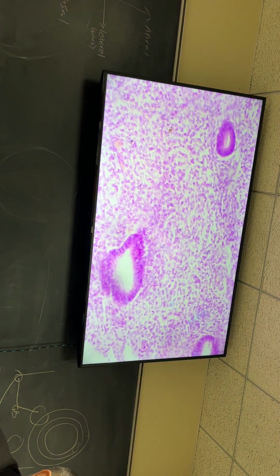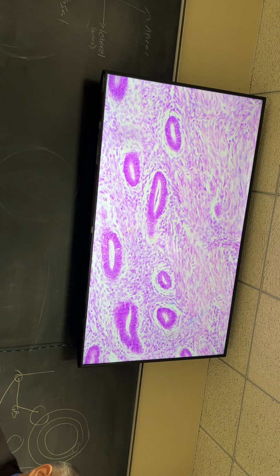All right. Anything about that before I go on to the next thing? All right, last one. Vagina, right? Again, 3 layers. They're fairly straightforward, very easy to see, really. Here they are, all of them. That's the whole smash right there.